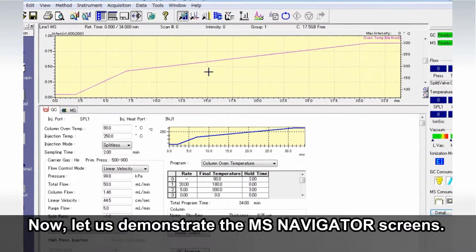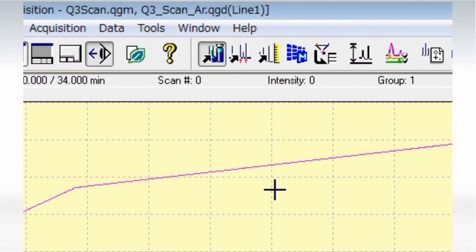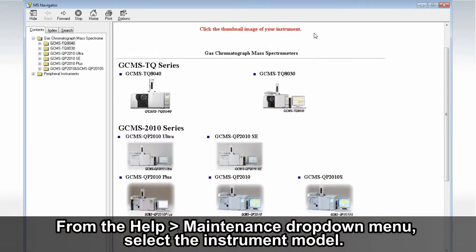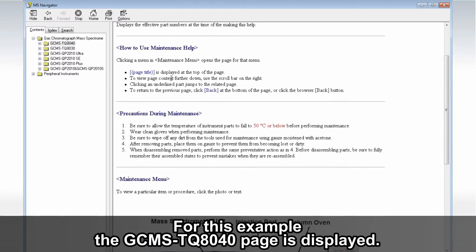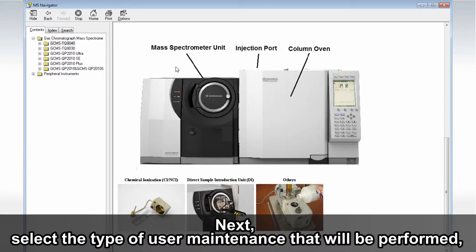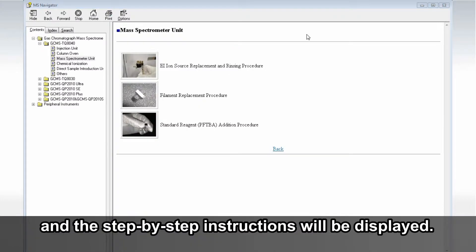Now, let us demonstrate the MS Navigator screens. From the Help Maintenance drop-down menu, select the Instrument model. For this example, the GC-MS TQ8040 page is displayed. Next, select the type of user maintenance that will be performed and the step-by-step instructions will be displayed.